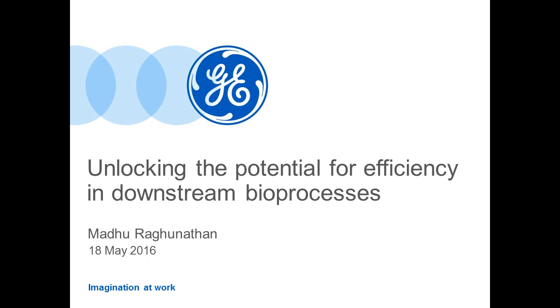Okay. How can intelligent columns handle significantly different resins, like ceramic-based resins or agarose-based? Yeah, I would say there are two aspects here when it comes to intelligent columns. One is the methodology itself, in terms of how these columns get to the point of having a packed bed. And the other aspect is the way in which the intelligence is built into the column, which is the pre-packed methods.